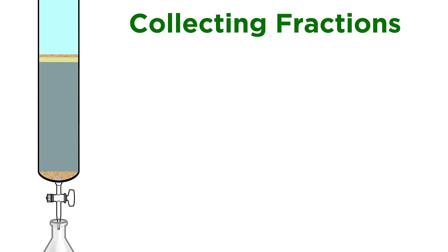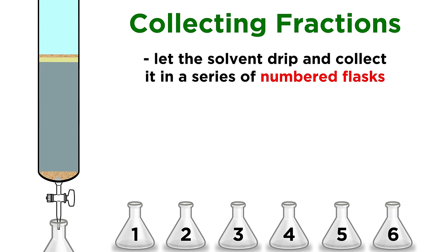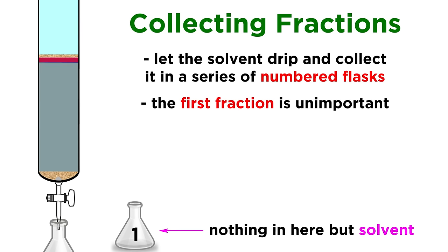Now the sample is loaded and we are ready to start. Let the column start to drip, and we will collect in a series of small flasks, each of which is referred to as a fraction. We don't have to be too careful with the first fraction, because we know that our sample is still way up at the top of the column, and none of the components will travel faster than the solvent. But depending on how polar the solvent system is, we will soon want to pay a bit more attention.